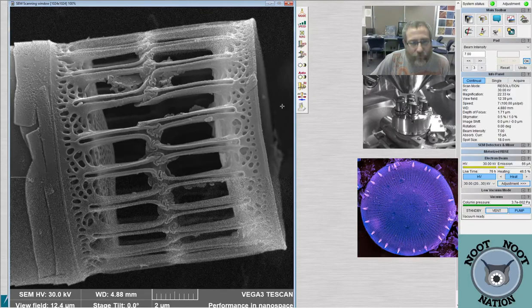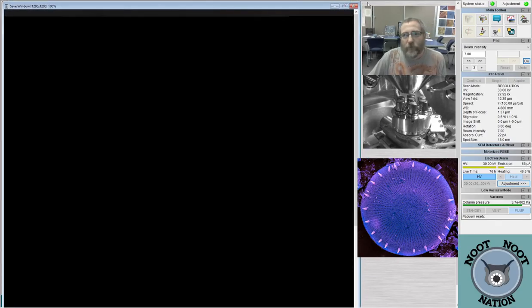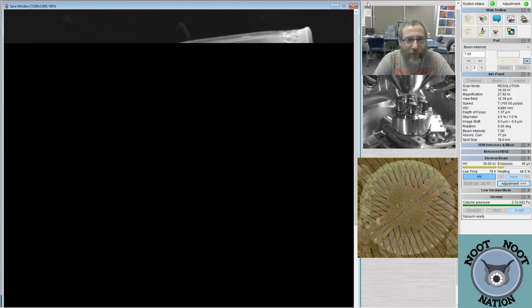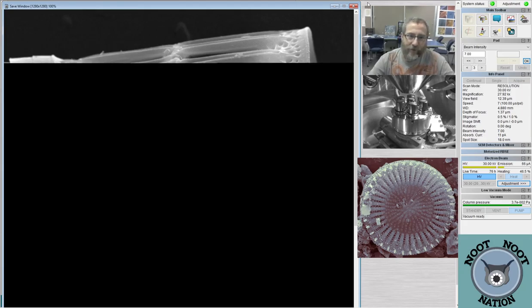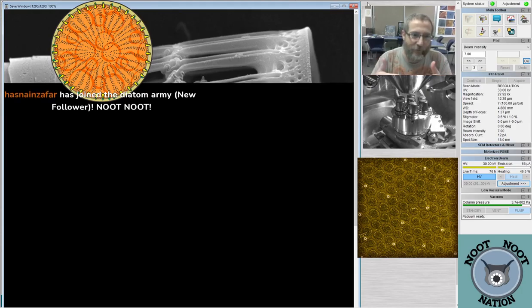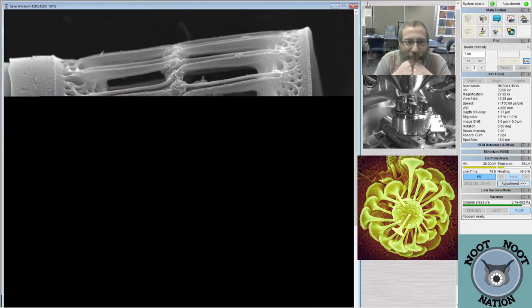What prompted my question is the way they join together reminds me of suture joints, right? It's not clean. It looks like they reached out towards each other at different paces. It's a little sloppy. They don't line up perfectly, like a suture, because they were reaching towards each other instead of starting there. My guess is they have to form from the valve face, and then the costae, the long structures, probably form next. And then when they touch each other, they probably start to figure out, oh, this is the piece I need to connect to.